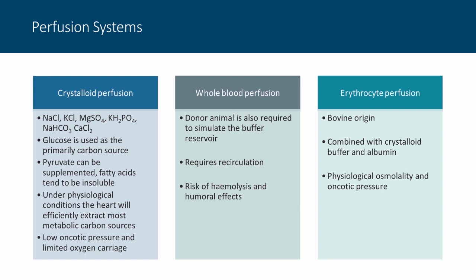Lastly, given that Krebs-Henseleit buffer is a protein-free system, the oncotic pressure is significantly lower than physiological levels, increasing the total tissue water, which can effectively simulate an edematous situation. This is further exacerbated by the supraphysiological flow rates required. In the absence of hemoglobin, the oxygen carrying capacity to the vascular bed can also be decreased relatively. Even in light of these supposed limitations, the crystalloid perfusion system does remain popular, mainly because of the low cost associated and the reproducibility of the production of the buffer systems.